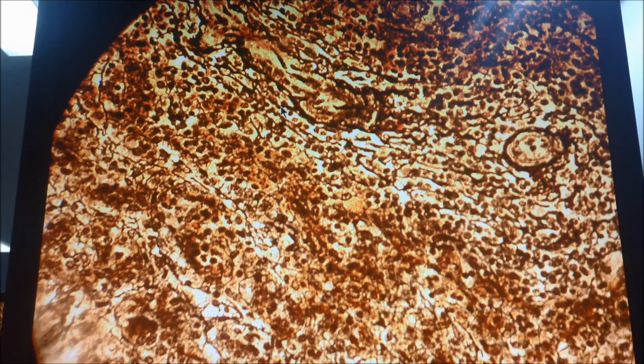Reticular connective tissue is found either in the lymph node, in the liver, in the spleen, or in the bone marrow. This one is in the liver. How to know that? You see this large circle in the middle. Each liver lobule contains a central vein, and you will study that in the future. What is required from you is to know that this is a reticular connective tissue only. But this one is specifically in the liver.